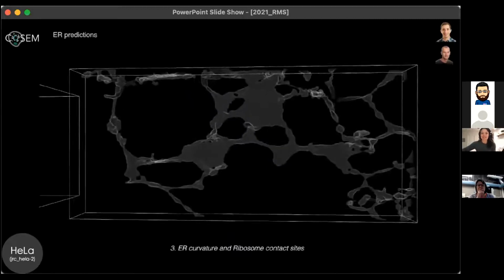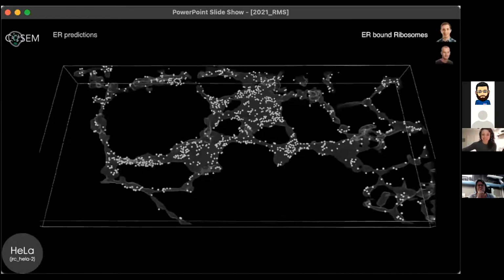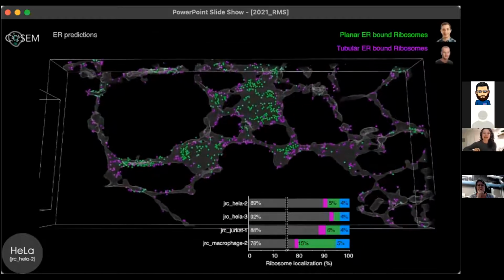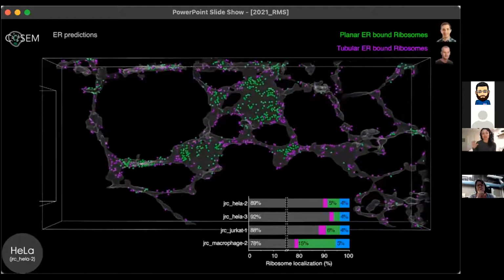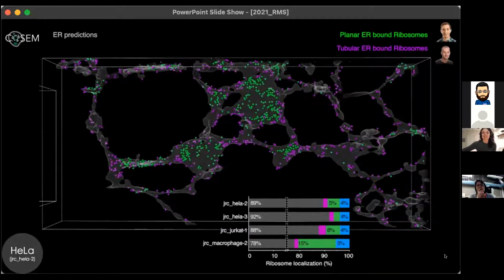So the third analysis I'd like to show is an example of the ribosome classification. So we start with all the ribosomes, there's lots, and then David classified them as being cytosolic or ER bound, and then further categorized them as being on planar regions of ER or tubular regions of ER. And what was interesting is that we found that the ribosomes on the more planar regions of the ER tend to form those beautiful polyribosome chains. So you can see some of those here in these flattened regions of the ER. This, interestingly, was corroborated with live cell imaging of ribosome translation and ER markers that's been done in the JLS lab.